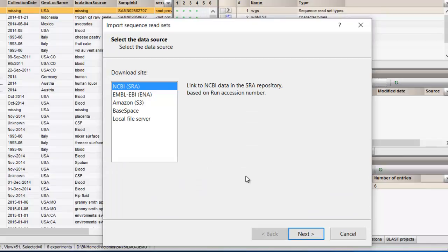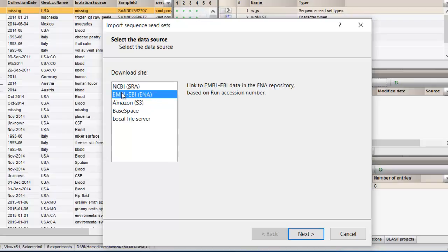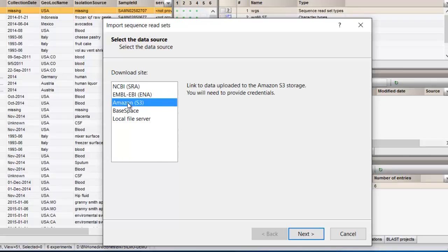Here you have an overview of the available data sources where you can link to. Depending on the choice of import, other parameters may be queried in the Import Sequence Read Sets dialog box.